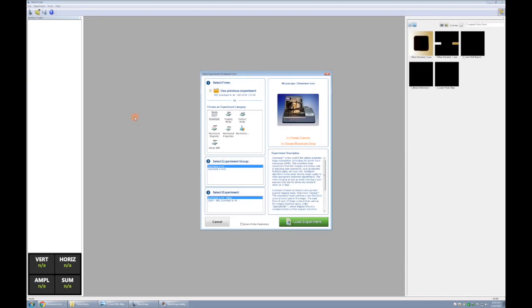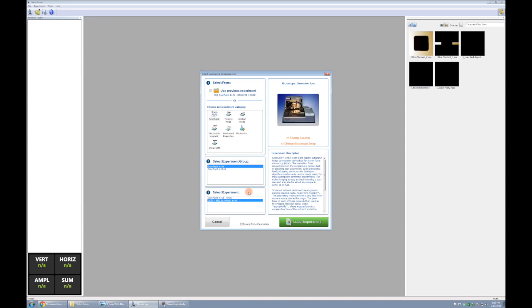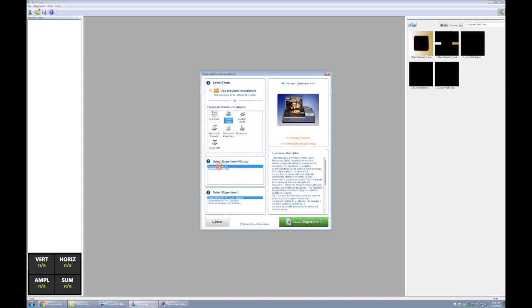When you open it up, it'll ask you to select your experiment. Today we'll be doing a scan assist experiment, which utilizes peak force tapping mode. We'll be doing a scan assist in air group experiment, and we'll be using the KNI scan assist in air experiment itself. If you want to do tapping mode, then you would choose tapping mode. You can do tapping mode in air or fluid. In our lab we mostly do air, and then you can choose, say, soft tapping or standard tapping.